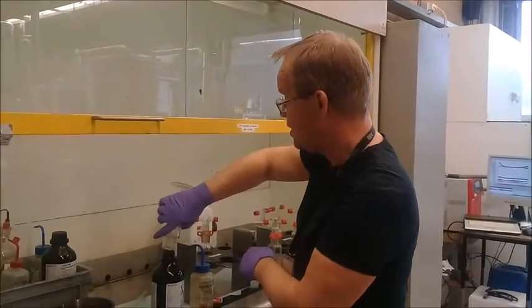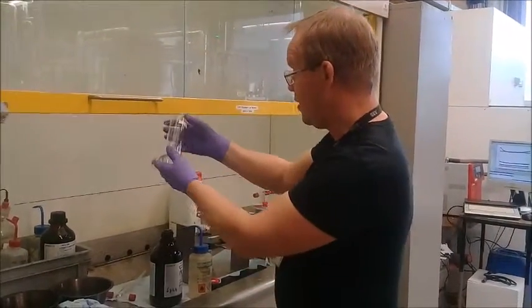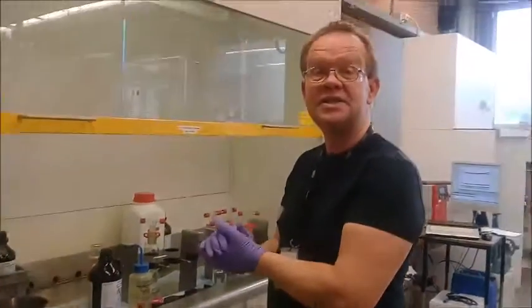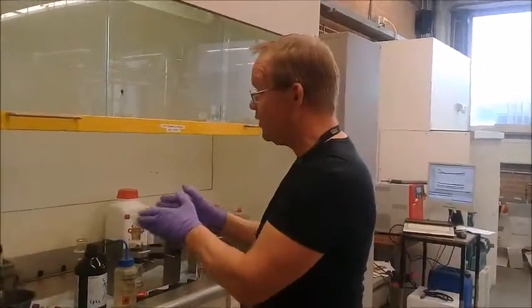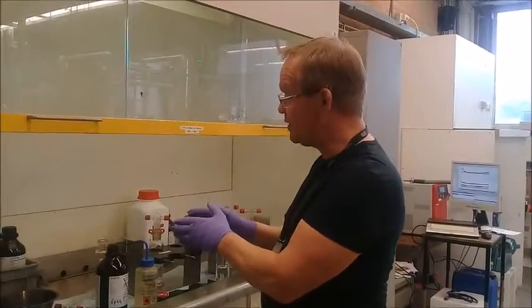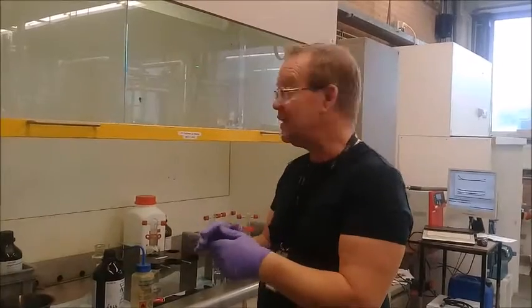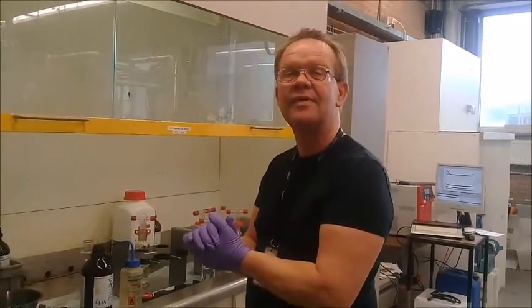So, there you are. Flush bottle, clean. And that I repeat 6 times, and then we have all the sample in the glass bottle. And I will take the glass bottle later on to the organic laboratory, and there it will be analyzed. Thank you very much.